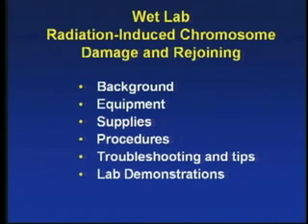And then after that, we will give you a detailed outline of what kind of equipment, supplies, and procedures you need to know in order to do a good chromosome preparation, so that you can use the chromosome spreading for this type of study.